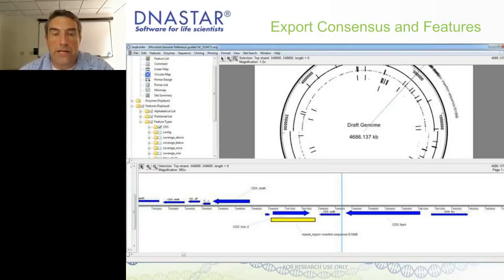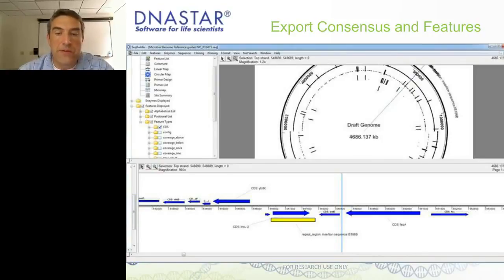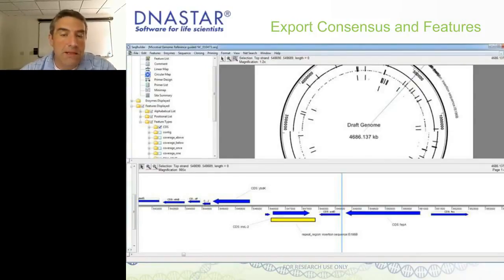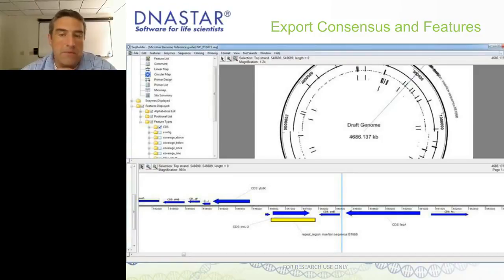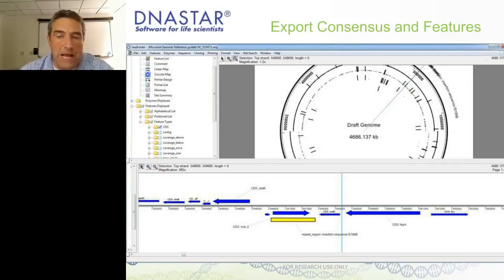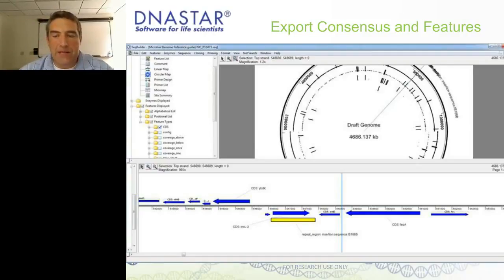From our software I can export to SeqBuilder, a fully editable program where I can look at circular maps and linear maps. I can adjust features, move features around on the map, name them, apply restriction enzymes, and create nice pictures. I can manually annotate here or BLAST and bring annotations in. So there are a number of different ways to annotate these sequences.